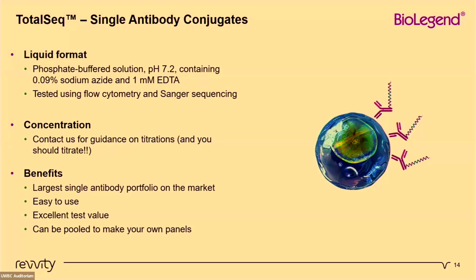So when you're wondering what that means, that's when you can come to us and we can talk about it. We have an entire blog on how to titrate antibodies, and a white paper even, I think. So for this application, we can definitely discuss.